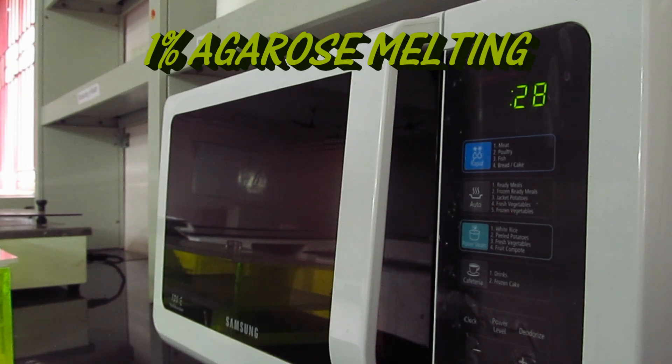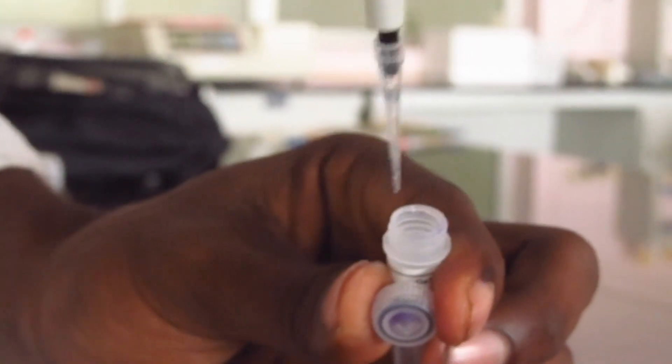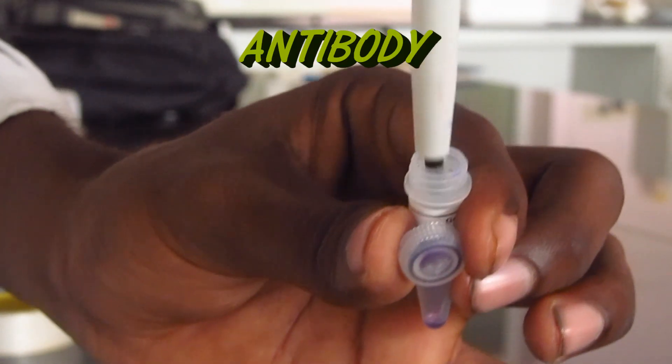Melt 1% of agarose with electrophoresis buffer. Add antibody in the gel when its temperature reduces.